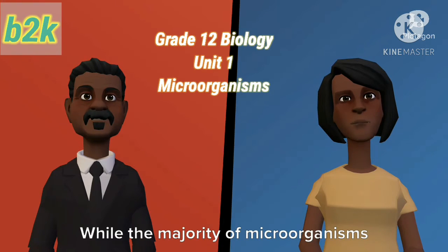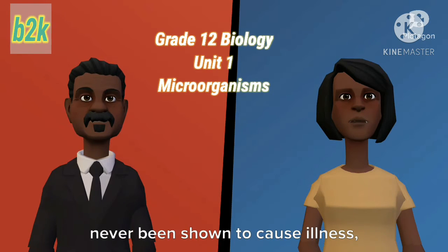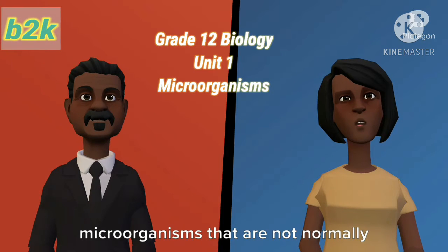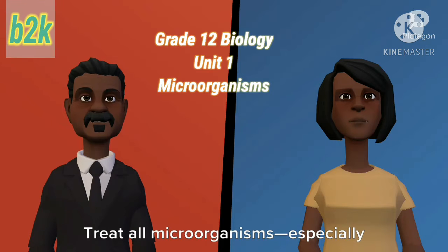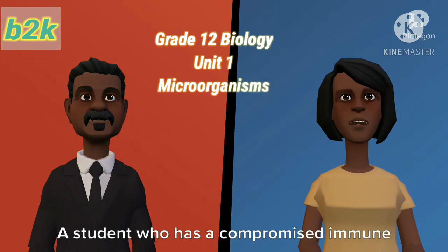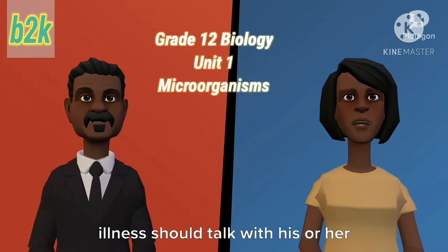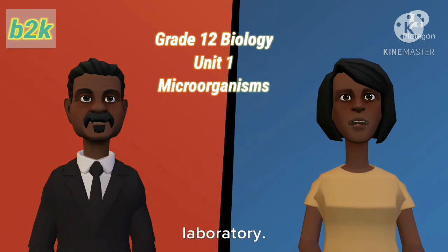While the majority of microorganisms are not pathogenic to humans and have never been shown to cause illness, under unusual circumstances a few microorganisms that are not normally pathogenic can act as pathogens. Treat all microorganisms, especially unknown cultures, as if they were pathogenic. A student who has a compromised immune system or has had a recent extended illness should talk with his or her instructor before working in the microbiology laboratory.